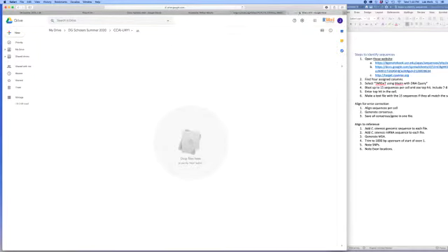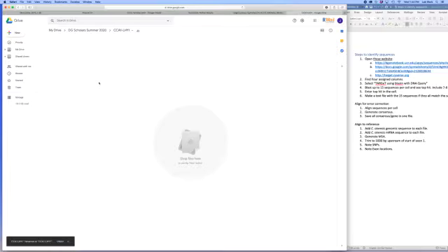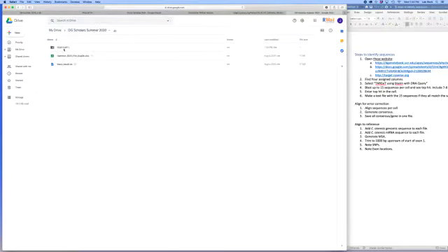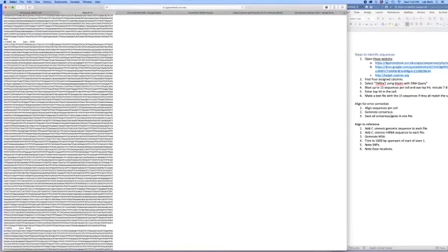When you start working on that, save each of the files here, and then it'll keep everything nice and organized. Okay, so there you go. That's what you need to do. So it's very straightforward. Go through each of these sequences here. Do as many as 15, checking them in Target, and let's see what gene they are.